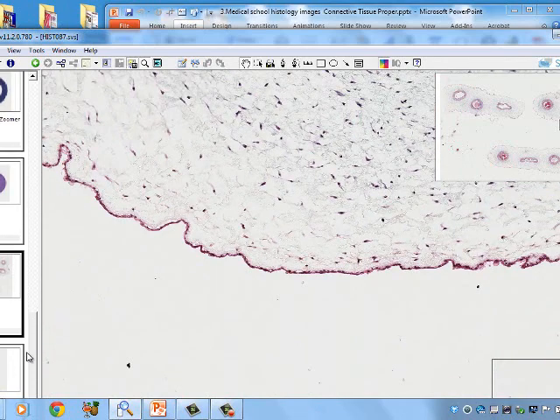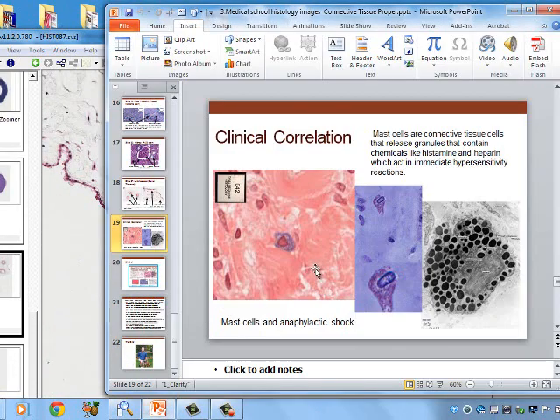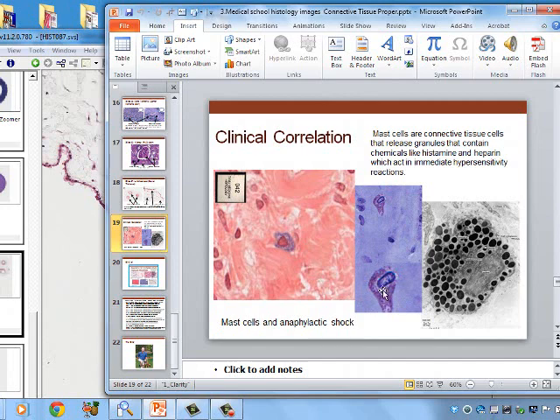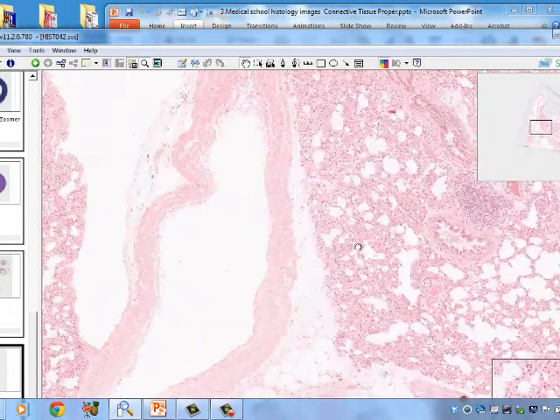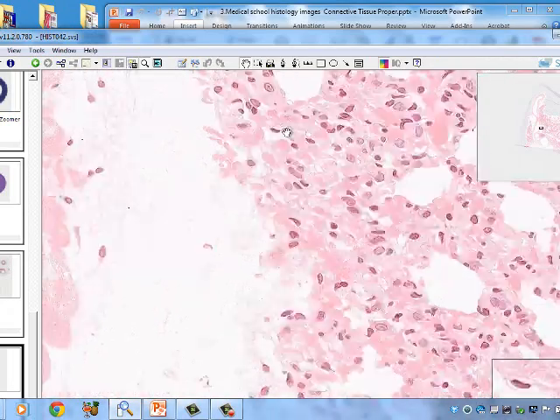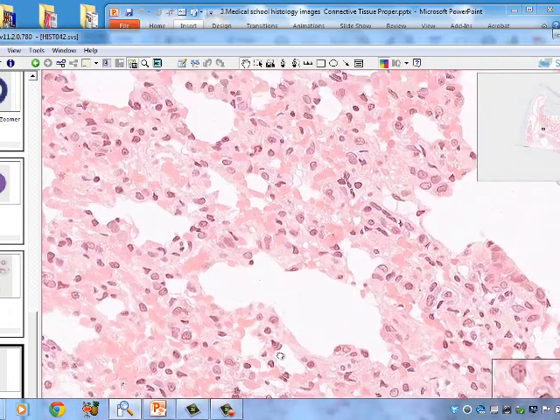The final clinical correlation involves mast cells in connective tissue and their release of histamine and heparin. In slide 42 we see a mast cell with a large, euchromatic nucleus and lots of granules. Note that the granules of mast cells do not have a crystalline core, unlike those of eosinophils.